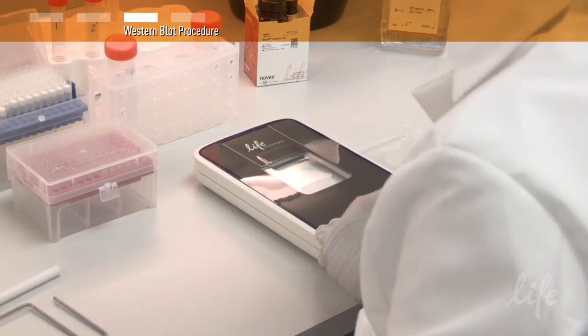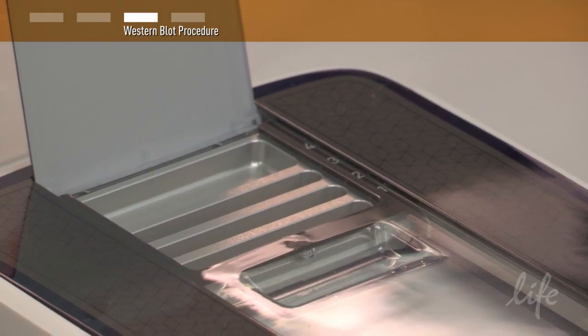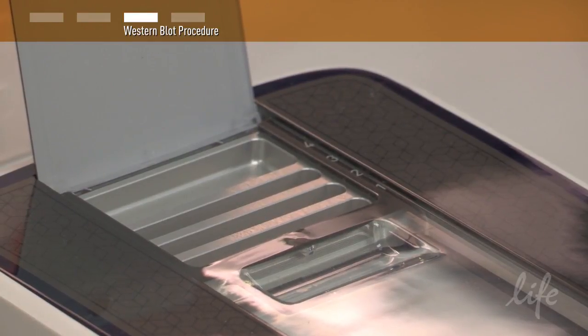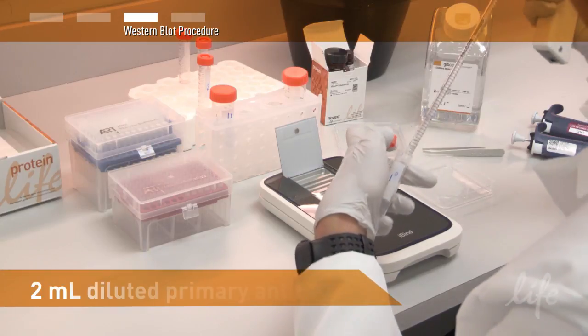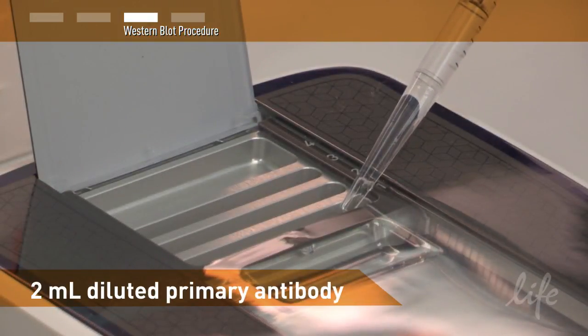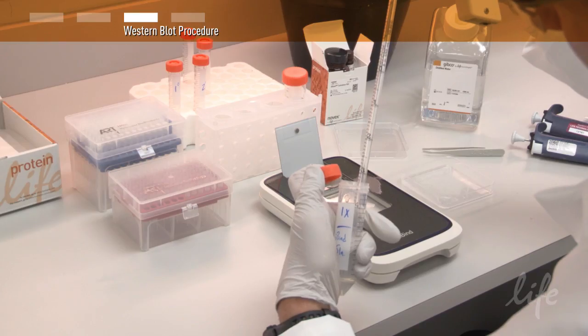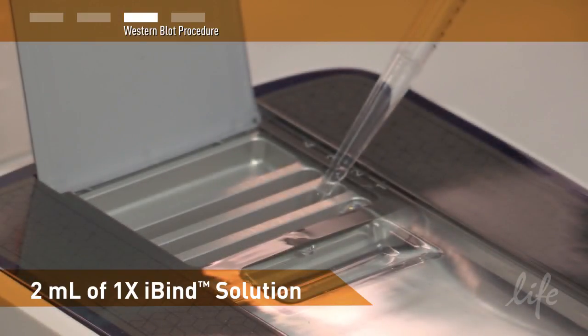Close the iBind device and open the lid exposing the wells. Add solutions sequentially to the iBind wells starting with well number 1. Load 2 milliliters of the diluted primary antibody into well 1. Then load 2 milliliters of the 1X iBind solution into well 2.